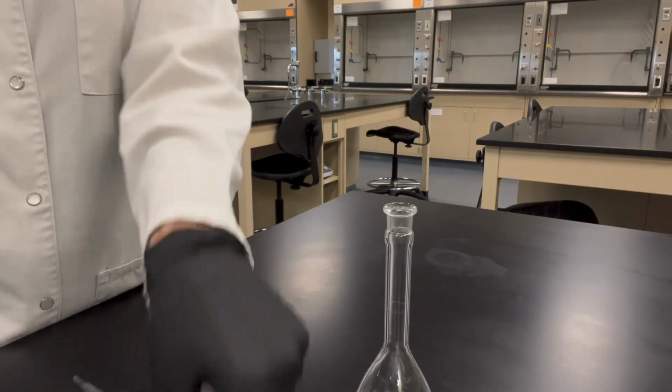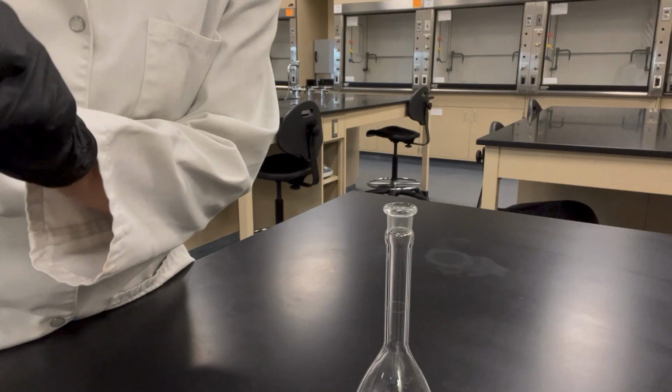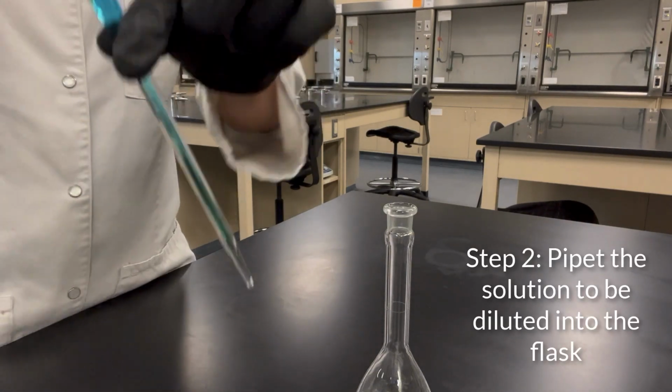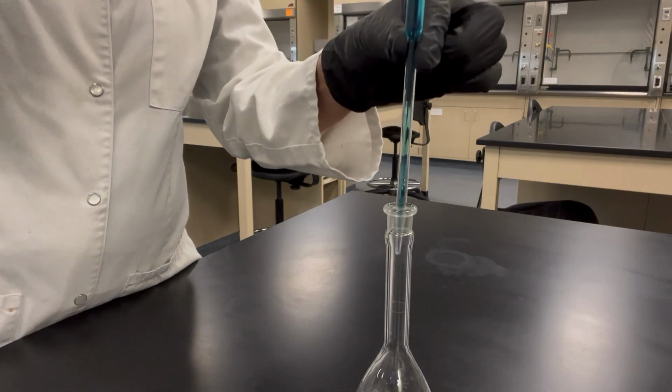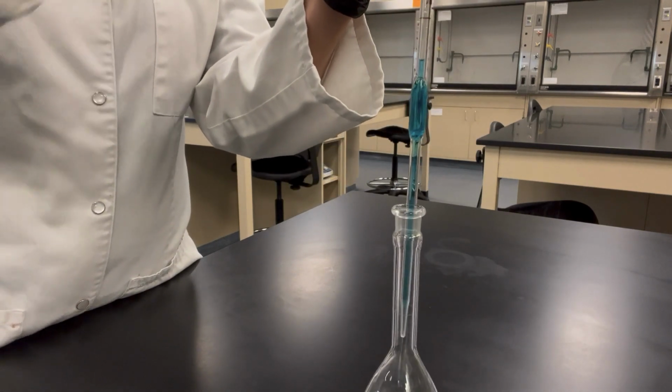Then you want to pipette very carefully the precise amount of the solution that you want to dilute. Once you have your solution that you want to dilute in your volumetric pipette, you can place that into your volumetric flask.